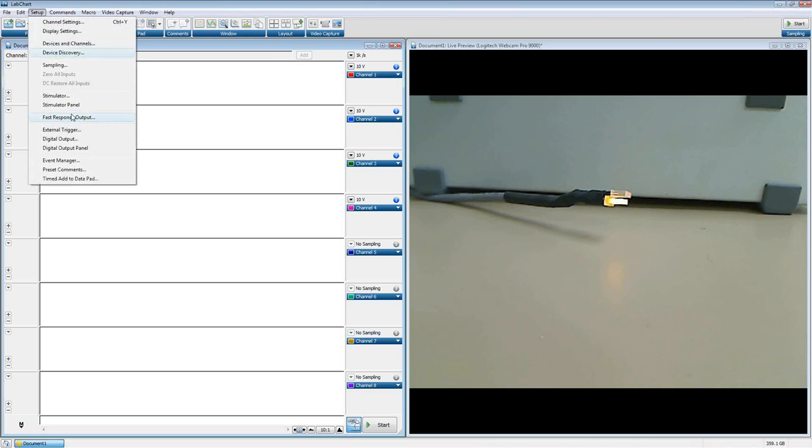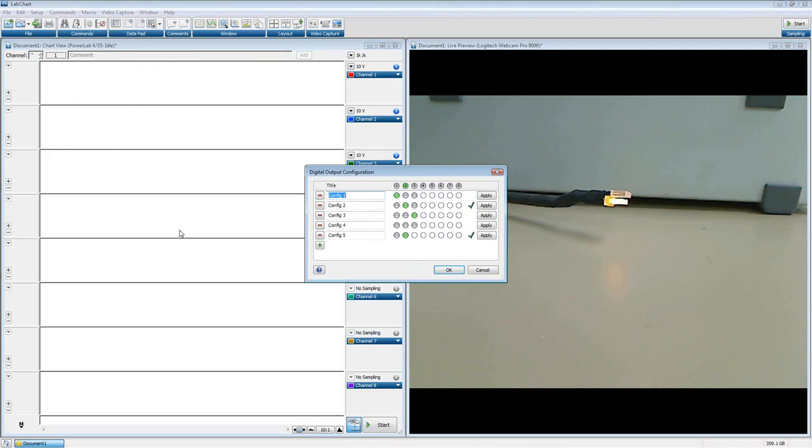I'm going to go in here because we could have some kind of conflicts later on with some of the other things that I'm using. I'm going to go ahead and delete these. So as you saw, by pressing the positive button, I can go ahead and add them. If I press the negative, I can go ahead and delete them. Actually, let me go ahead here and reset them all. Make sure they all turn off.